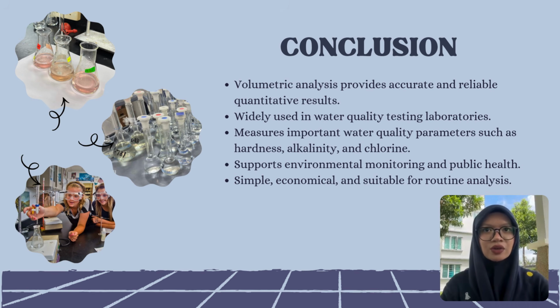Compared with many modern analytical instruments, volumetric analysis is relatively simple, cost-effective, and easy to perform while still maintaining good accuracy. Therefore, it remains an essential technique in analytical chemistry and plays an important role in public health and preserving the environment. That concludes our presentation.